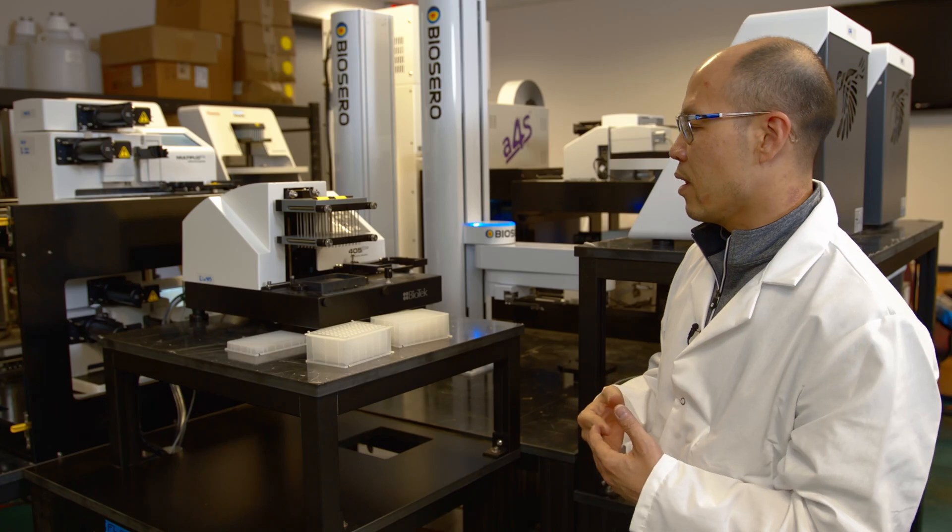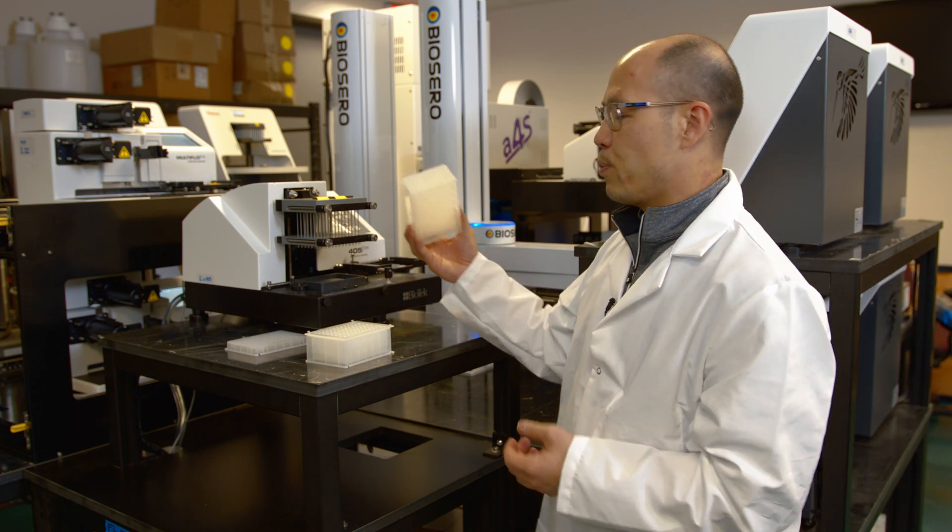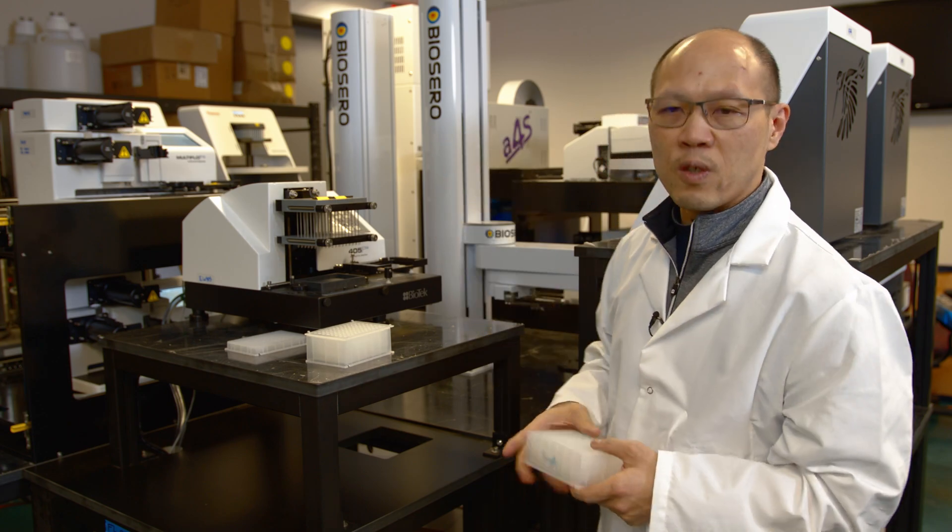At the end of the whole process itself, it is considered a patient sample. So it is aspirated out of these wells before they are thrown into waste.